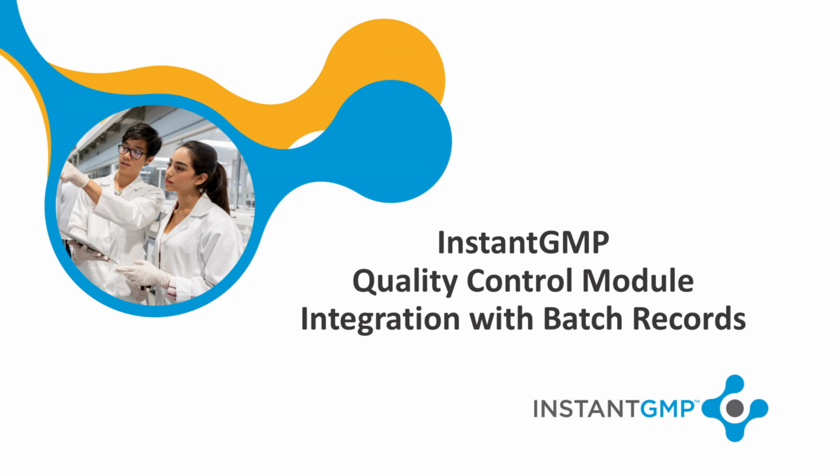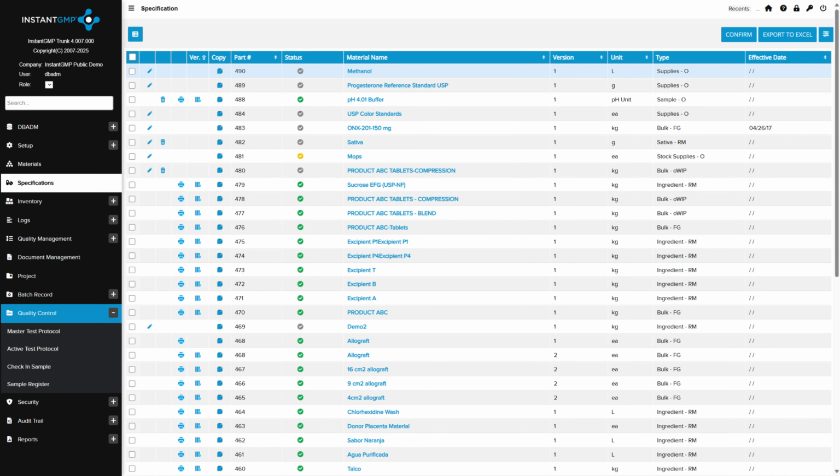Welcome to this video demonstration of how the quality control module integrates seamlessly with batch records in the InstantGMP software. Let's start with the specifications.